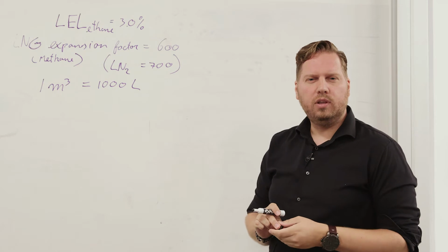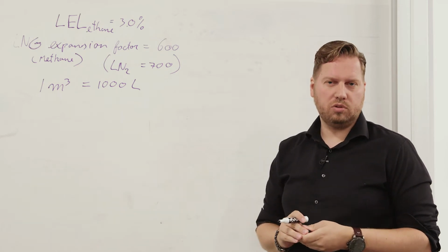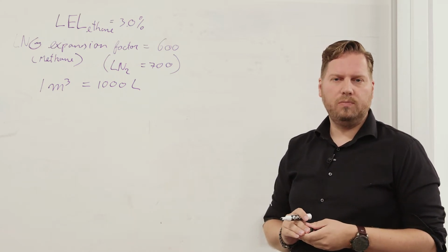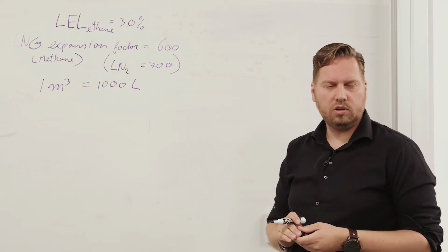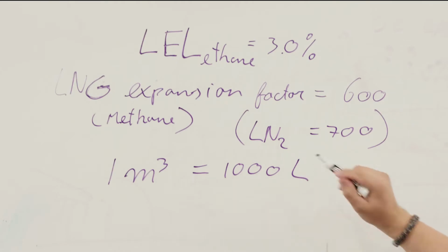Since we're dealing with ethane to prepare our samples, we have to realize that ethane is a combustible and also potentially explosive gas. Now, for a safety hazard, there's a number of values that we need to consider when we're dealing with ethane. And those are these values here on the board.